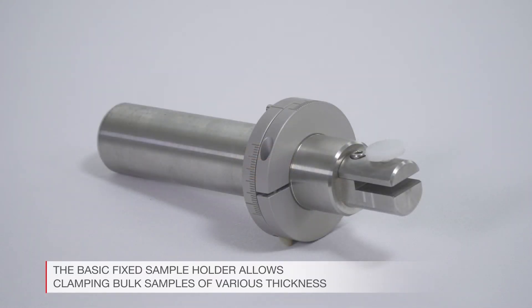The basic fixed sample holder allows clamping bulk samples of various thickness.